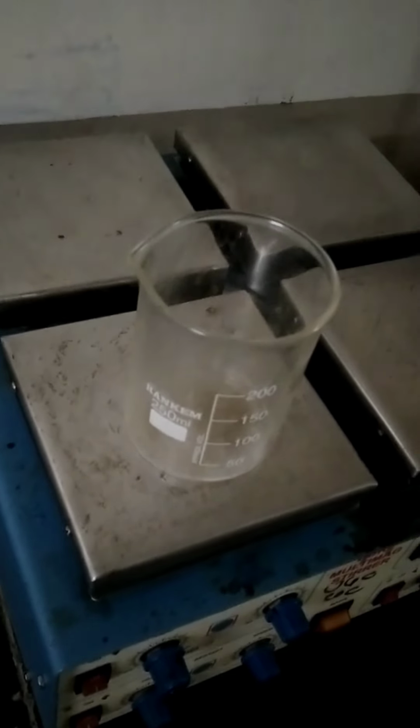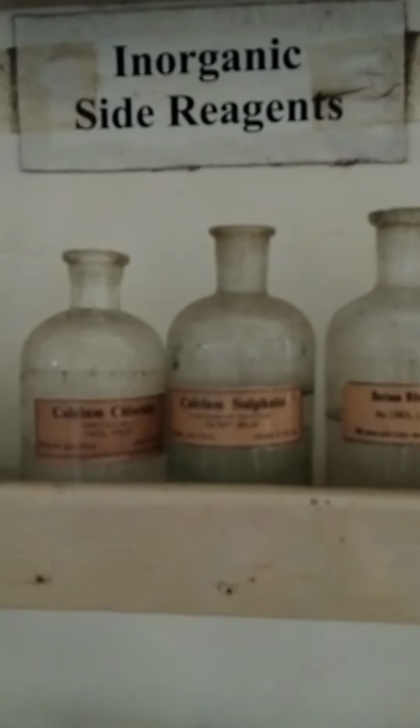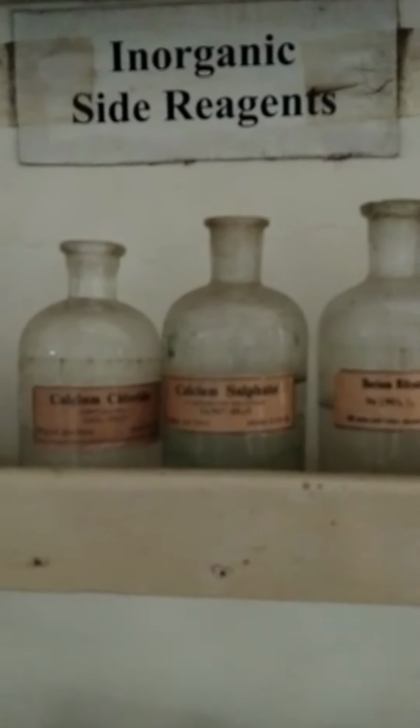These are the side reagents which are used in the laboratory for various types of test tube tests, for the burette solutions, in the flask for titrations, in the qualitative analysis of the radical ions. This type of inorganic solutions are kept aside in the compartments.